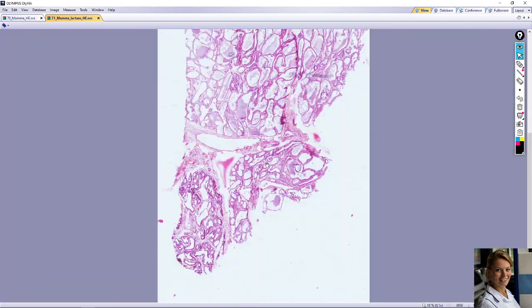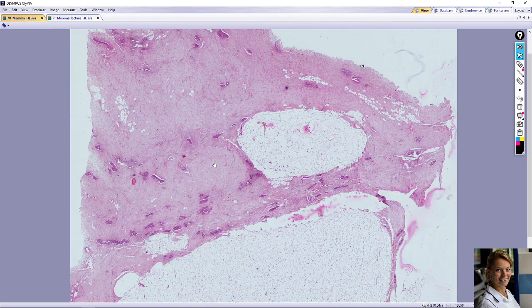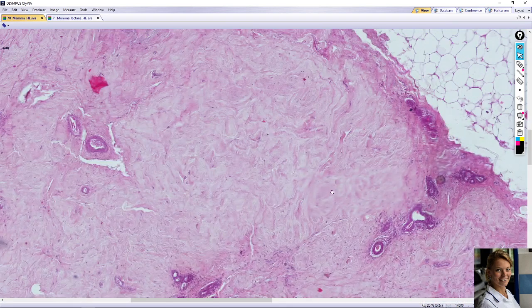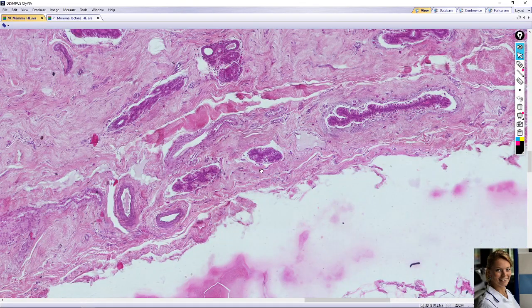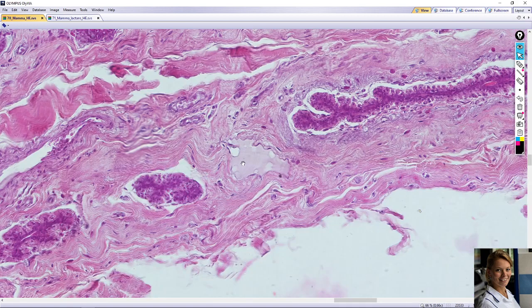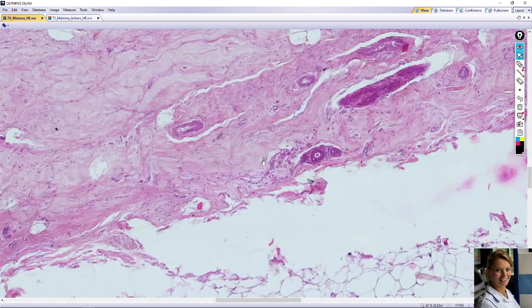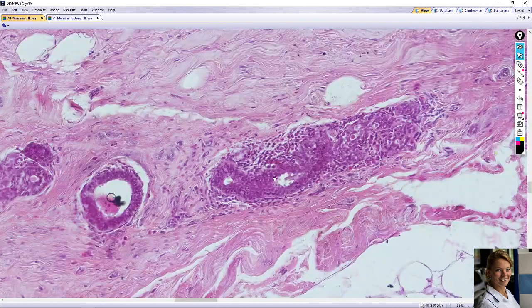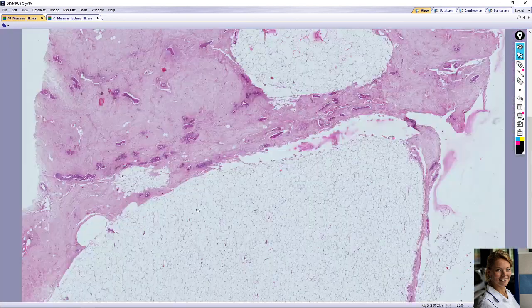So that's all for the mammary gland. Here is the inactive gland: a lot of dense irregular connective tissue, and interlobular connective tissue with blood vessels, interlobular ducts, and lymph vessels. In the lobe you can see intralobular ducts and loose connective tissue. The intralobular ducts are lined with cuboidal epithelium, surrounding myoepithelial cells, and a lot of adipose tissue.